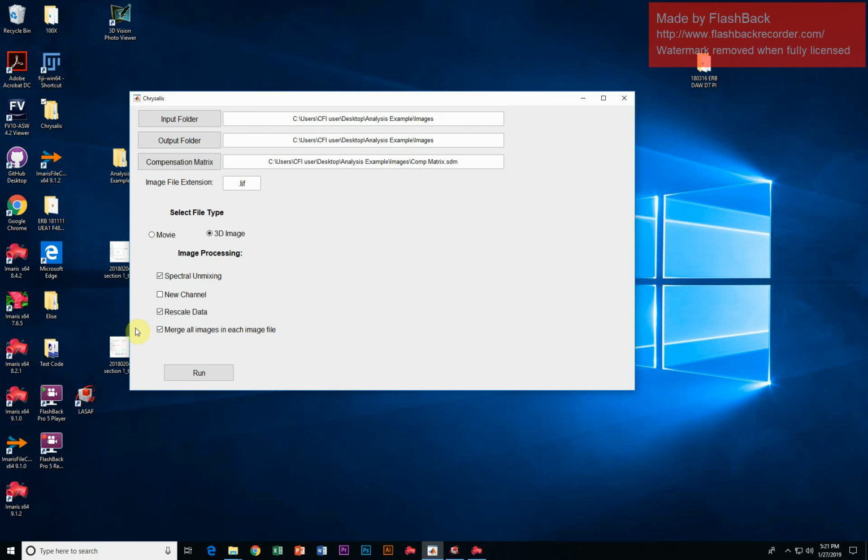I found this really useful because with confocal microscopy, especially high-resolution confocal microscopy, you're not going to be able to tile large images in a reasonable amount of time, so you might select specific portions of the tissue to image. If you do that but want to analyze it as if it were a stitched together image, then you can use this to do that.